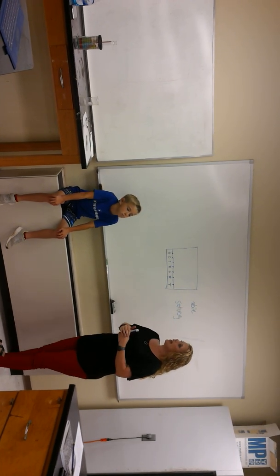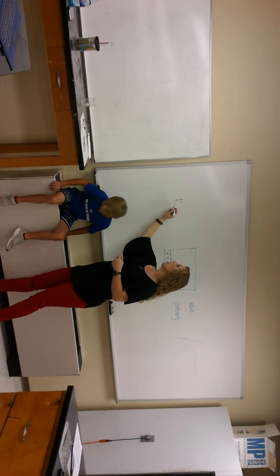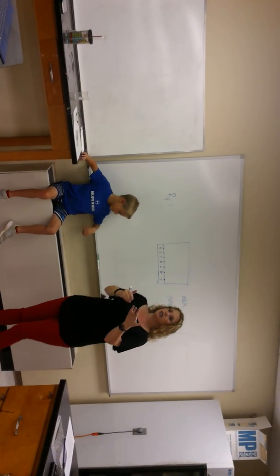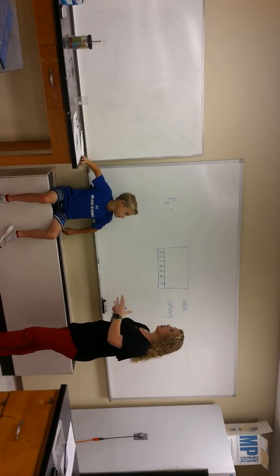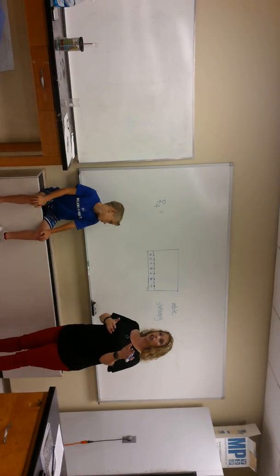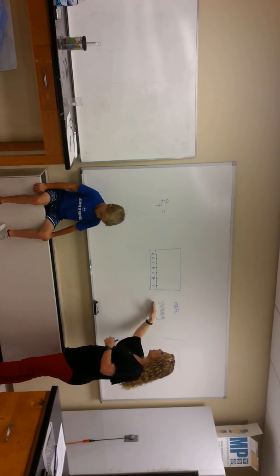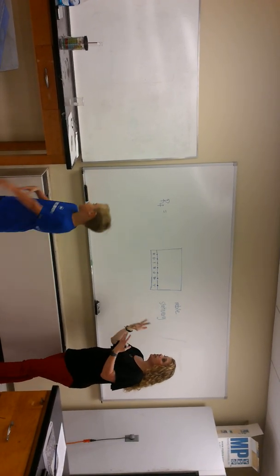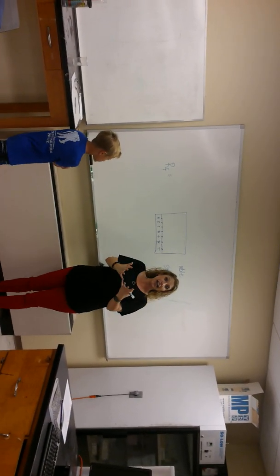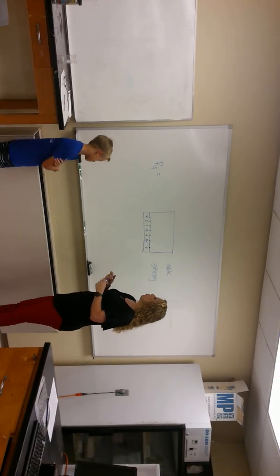Now, we're going to calculate from that what's called a retention factor. We write that as RF. Now, retention factor is not like density. If I want to know the density of lead, I look it up in a textbook. But if I want to know the RF factor of yellow dye number 5, I can't look it up in a textbook because different mobile phases and different stationary phases have different RF factors. So RF is something to compare with like things. I can't look it up in a book. So that's what we're going to do.